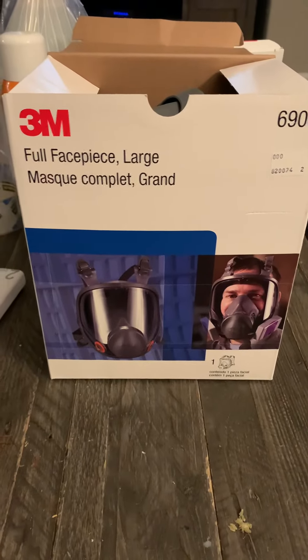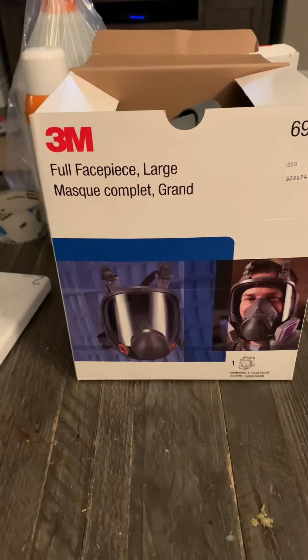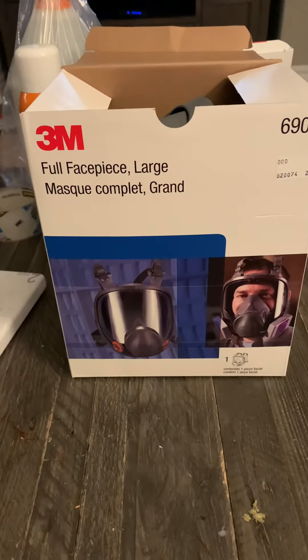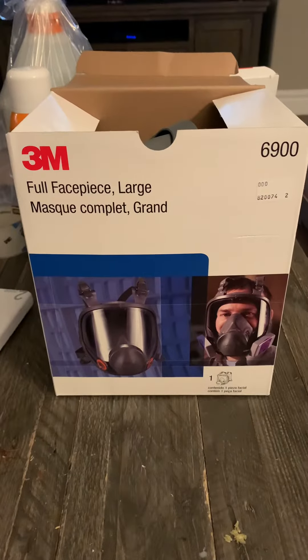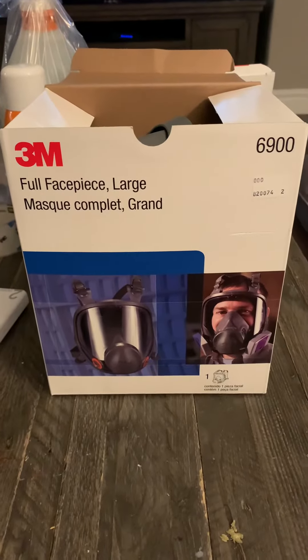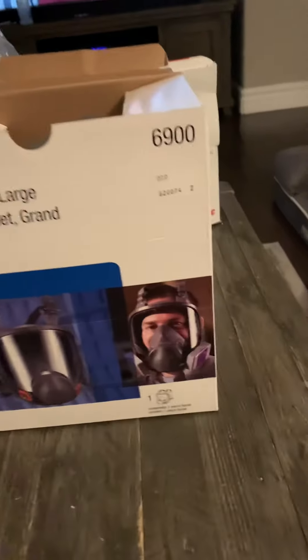It's going to be a 3M reusable full face mask. That's when it covers your eyes and your face. You can switch out cartridges for different contaminations. You can use P100s, N95s, charcoal filters, these.